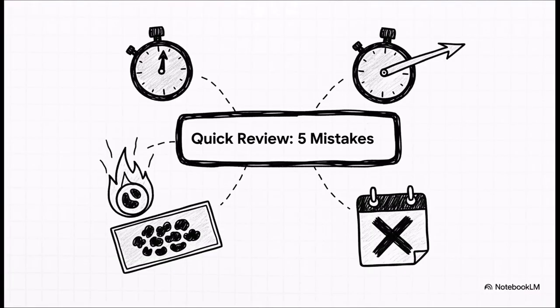So let's do a super quick review. Our 5 big pitfalls are: 1. Over-decolorizing. 2. Under-decolorizing. 3. Using cultures that are too old. 4. Making your smears too thick. And 5. Going overboard with the heat fixing. Any one of these can send you down the completely wrong path.